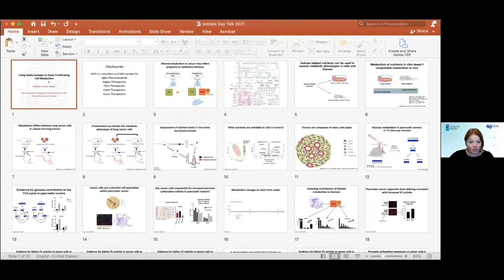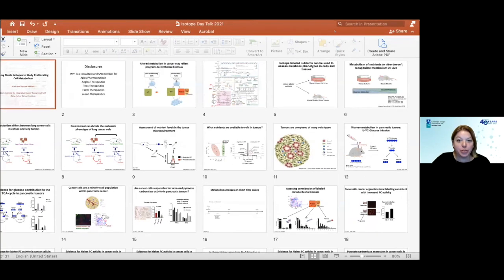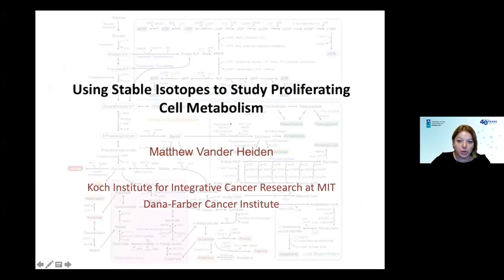Excellent. Thanks, Andrew. So we are a little bit behind schedule, but I think that's okay. I do have a quick question. You talked about 13C versus deuterium in some of the mixes. Can you speak a little bit about the benefits of carbon-13 versus a deuterated standard?